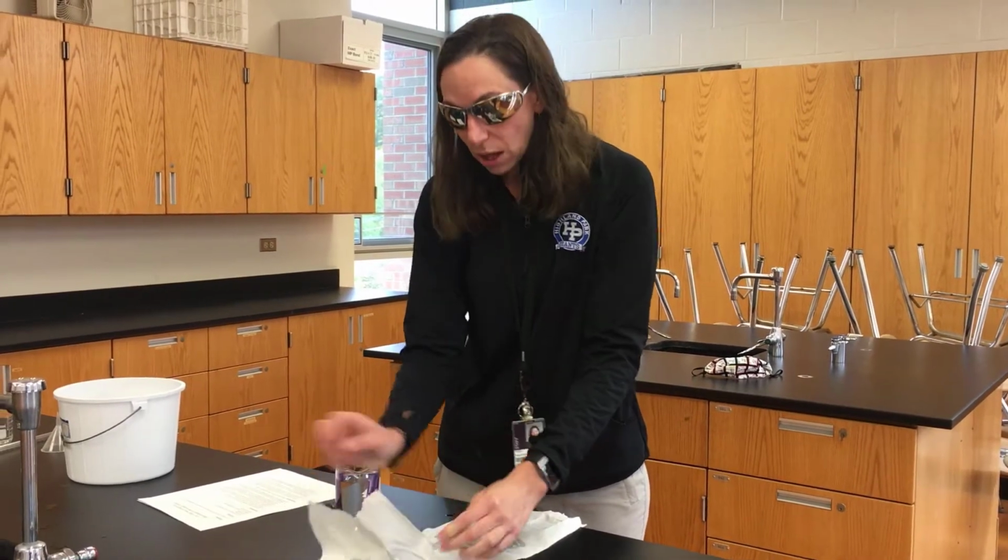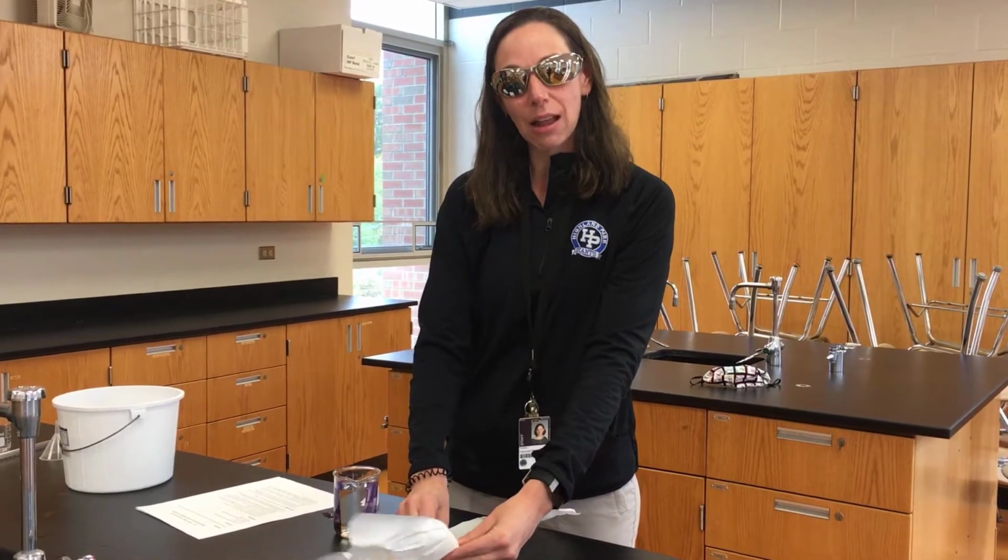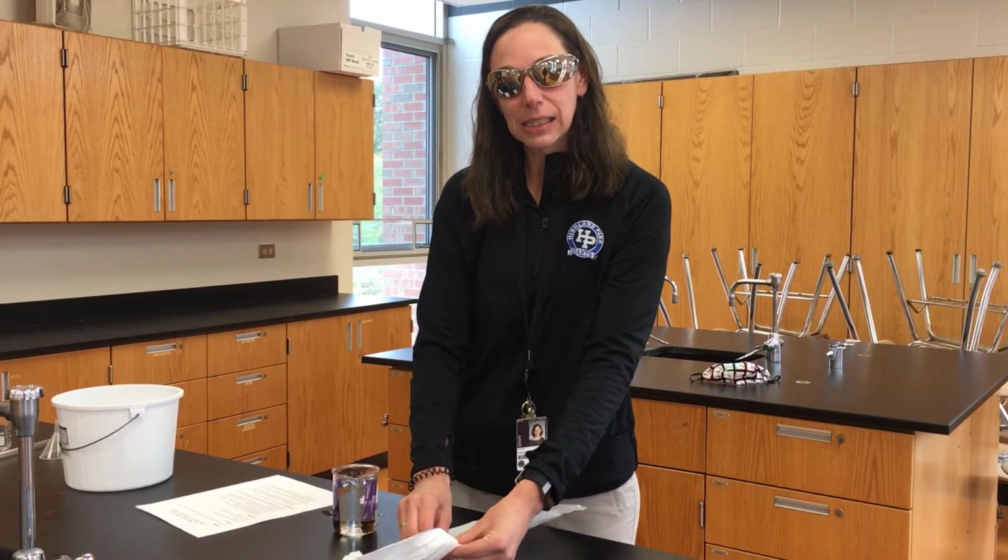And then we will also give you data. We're going to show you one trial, but we'll give you data for the second and third trial, and you might do a little error analysis.